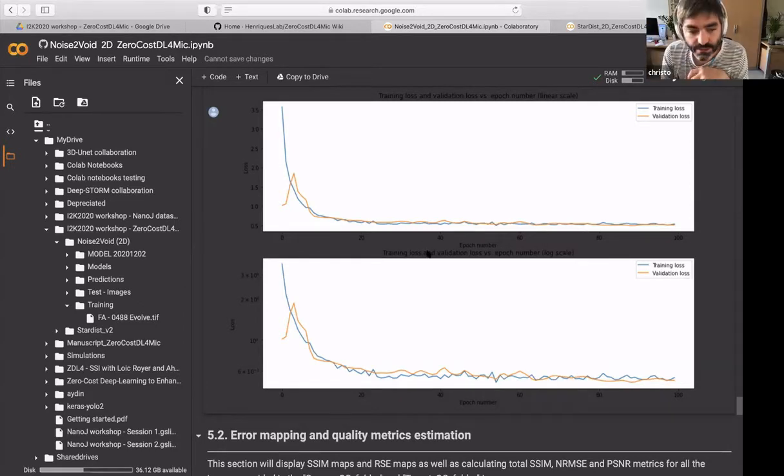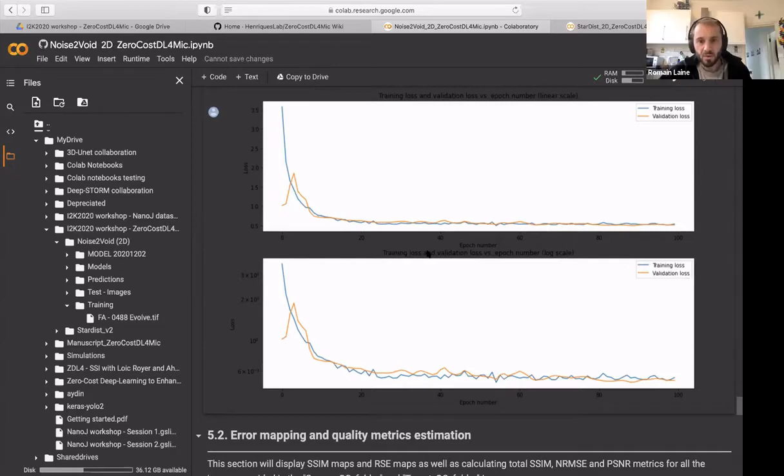Is it normal that the validation loss ends up less noisy and a bit below the training loss? I've also noticed this, and I actually don't have an answer why it is less noisy. My only intuition is that the validation loss will be computed on fewer images than the training loss, and therefore there's, to a large extent, lower diversity in the validation loss than the training loss, right?